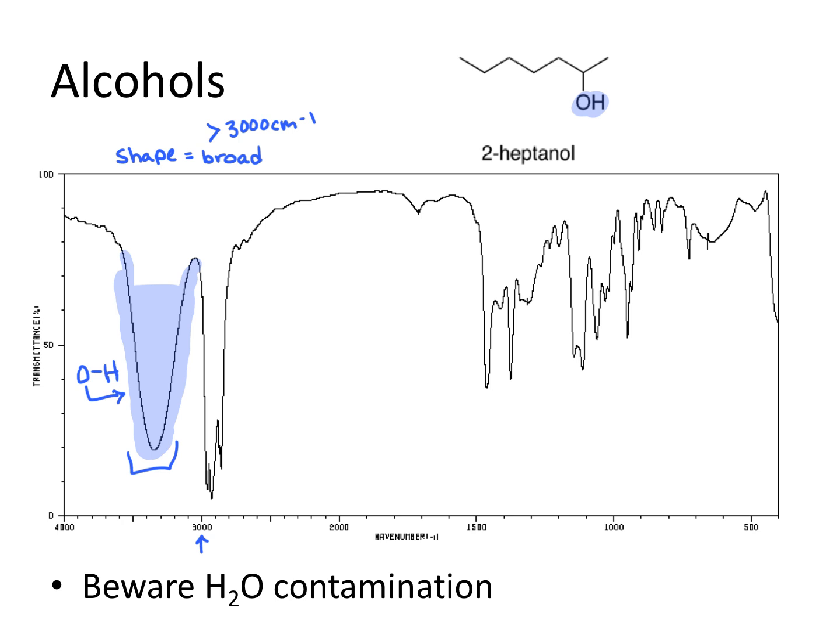If I knew something was an alcohol and I was trying to label it, I would label two key peaks. Firstly, I would do the one on the left, the one that's above 3,000, this one right here. That's the OH, so always label it as if it's the bond. The bond that we're talking about is the O to the H bond. The other peak that is a key peak is the CO bond, right?